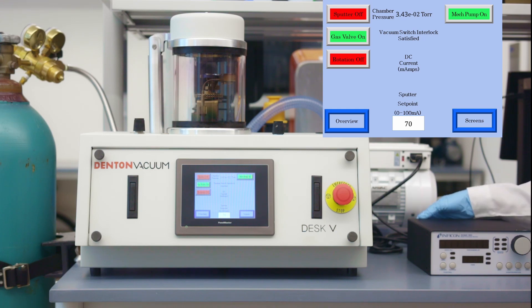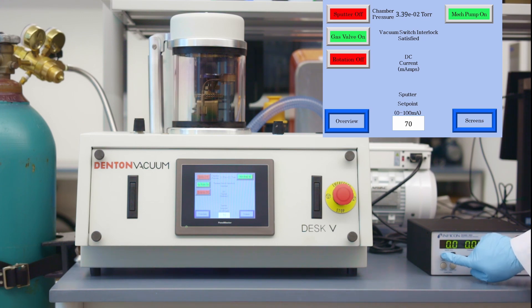Now power on the thickness monitor by toggling the power switch on the back of the monitor. Once the thickness monitor is turned on, press the zero button.